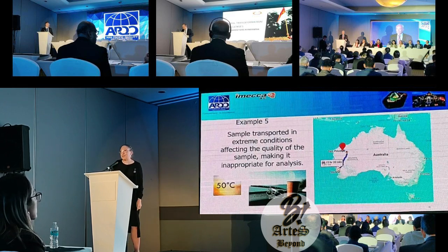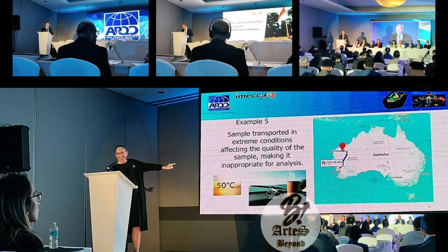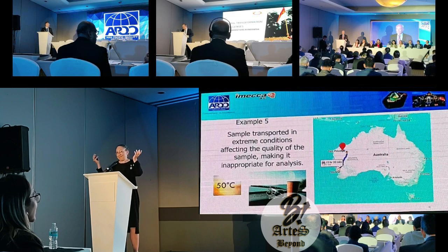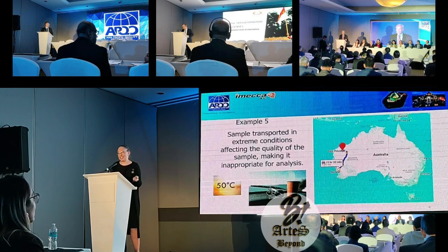The average temperature can be 40 degrees, 50 degrees Celsius during the day. How did they bring their sample back? I'm not kidding. On the dashboard of their car, they brought the sample back. And then they give it to the lab and say, please test this, tell me, what is in it now? I can't remember what the laboratory was testing for, but it affected it to the point where that sample is useless. But the client thinks, I gave you a sample, test my sample, give me the result. Did it pass? Did it fail?